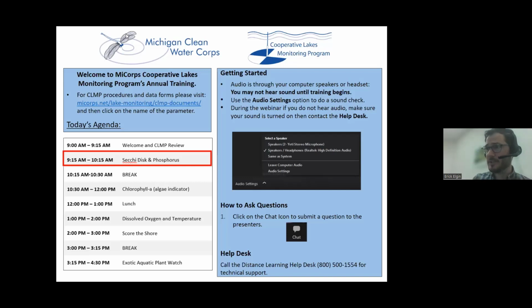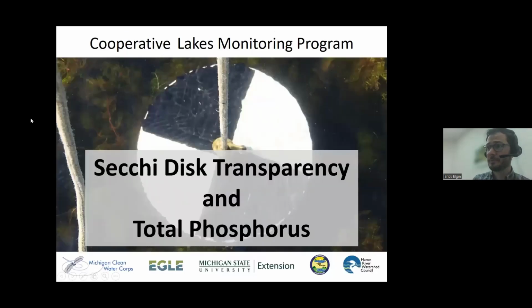I'm going to be presenting our first two basic parameters, so you can join this in your first year, and that's Secchi disk transparency or water clarity and spring and summer total phosphorus.